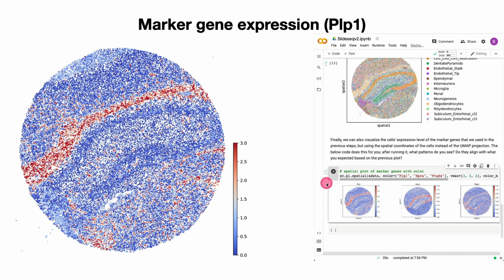So that's it for our notebook. Hopefully this example with the mouse brain dataset gives you an idea of how we can generally learn important information from a single-cell RNA-seq dataset. So in summary, our body is composed of many different types of cells. By identifying each cell and its unique characteristics, we can understand how all our cells work together to help our body function. And furthermore, we can understand how they respond to different conditions, such as disease or environmental stress. And one way to differentiate cells is by their differential gene expression profiles, which we can measure with single-cell RNA-seq, as we learned today.